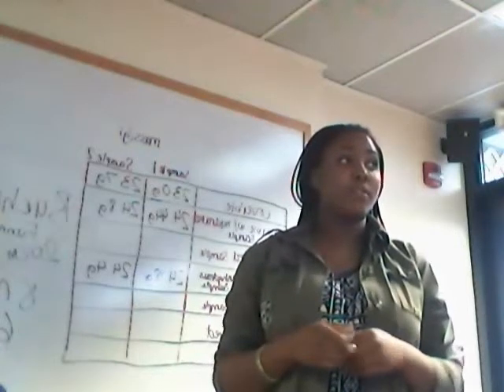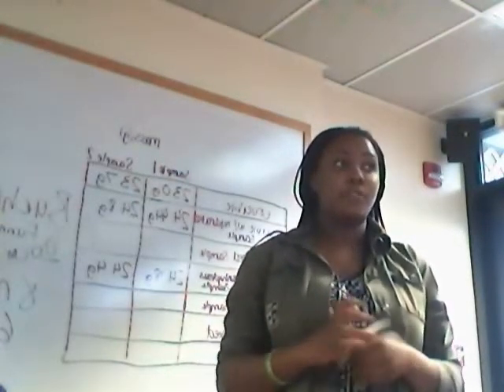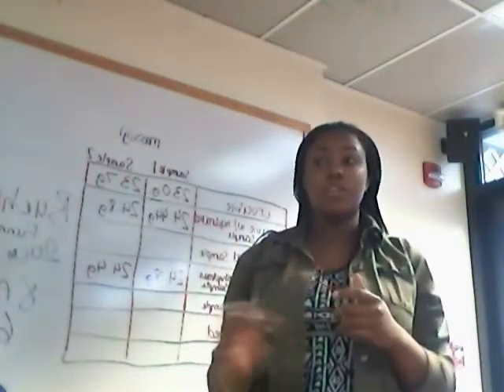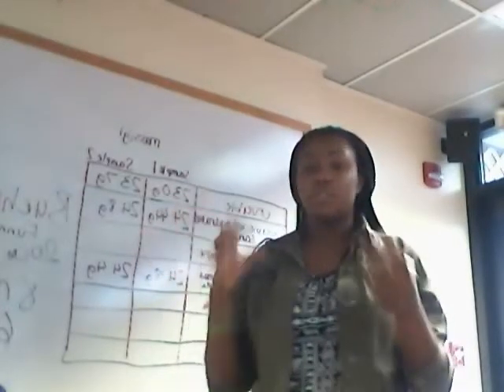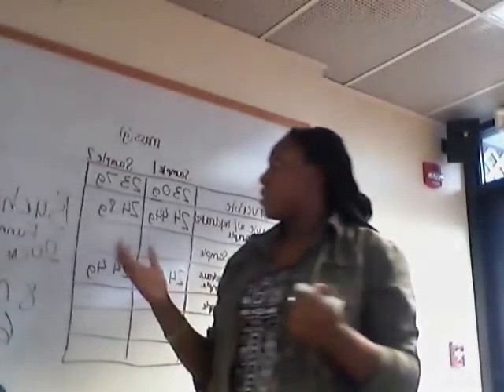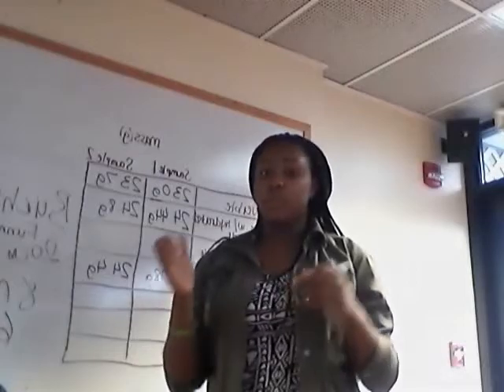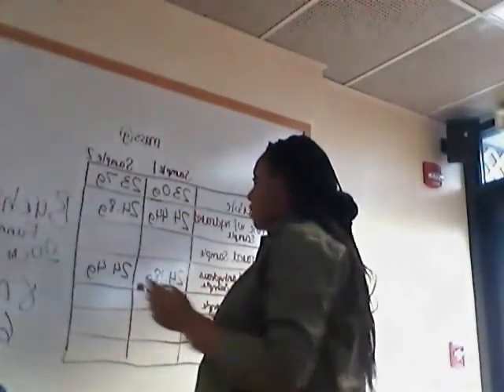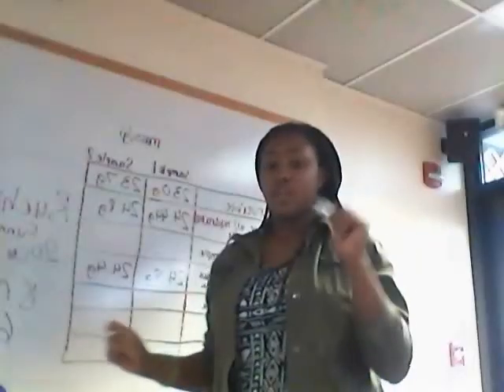So when that is dry completely, you take the mass of that. But first of all, before you do that, you have to get the mass of the filter paper, because you will use the filter paper to get the copper, and the mass of the filter paper was given. After that, you calculate the mass of the filter paper and the copper together. When you get that, that's how you get the mass of copper. When that is done, I'll give you the values for that.